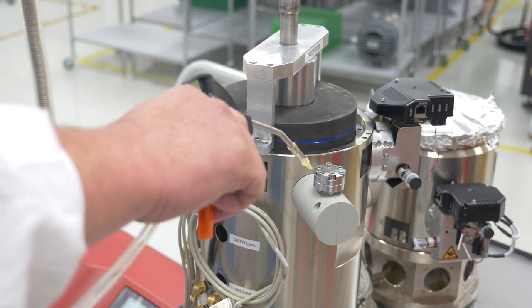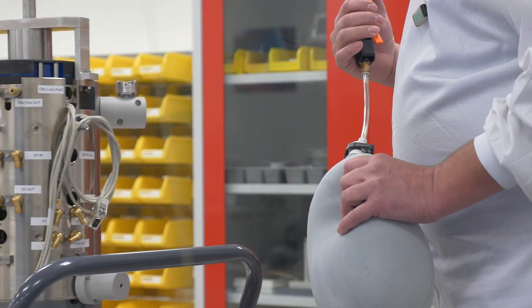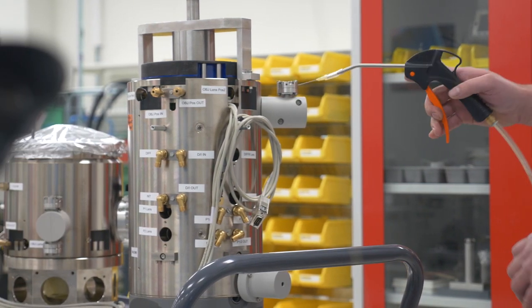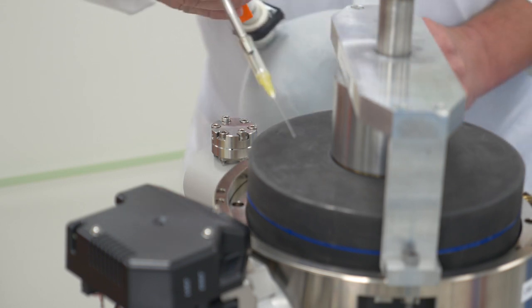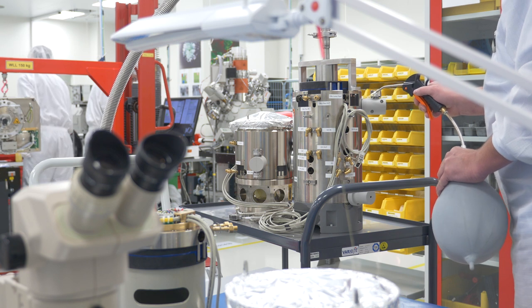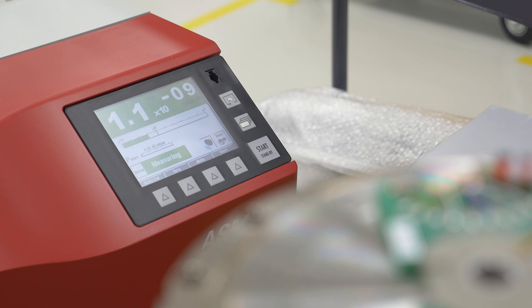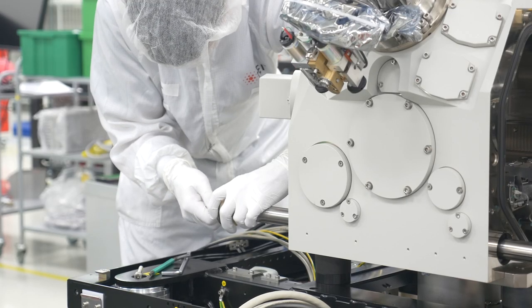To ensure perfect tightness, the device is tested in various phases of work by a special mass analyzer set to detect helium. Helium is blown upon the system from the outside, and since it does not commonly occur in the environment, it is easily detected. If the detector does not discover the presence of helium in the system, they know in FEI that the part is perfectly tight and they can move to another phase of production.